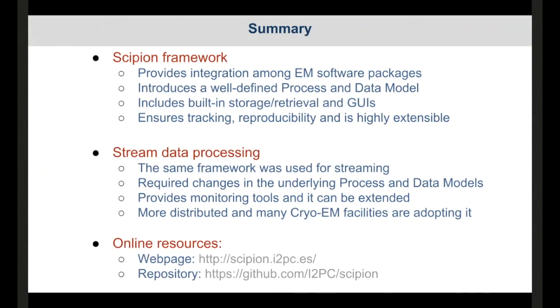And then through all this modeling process, we have ensured reproducibility and tracking. And I think it's quite important to share all the results with someone and be able to follow all the steps. Also, compared to other packages, many operations like subsets or modification of the data are done manually with file editing. In Scipion we have tried to make a record of all these operations, and then it's there in the history.